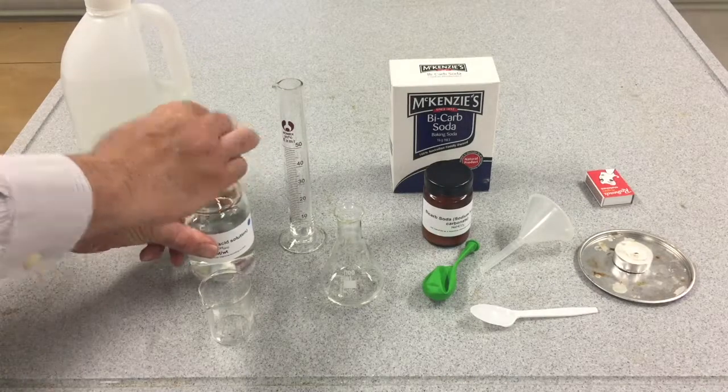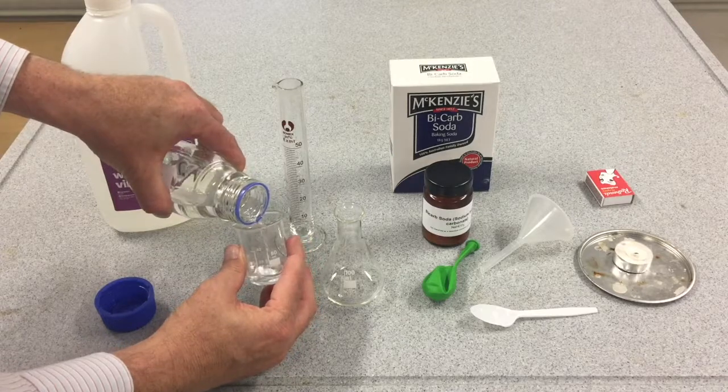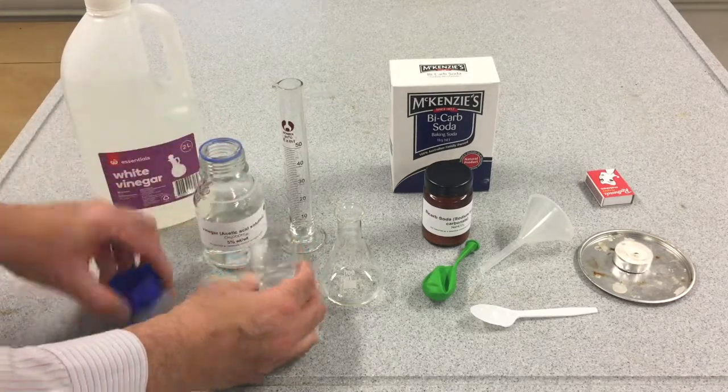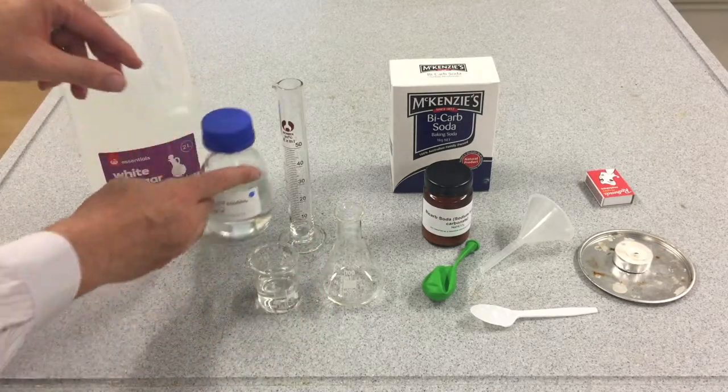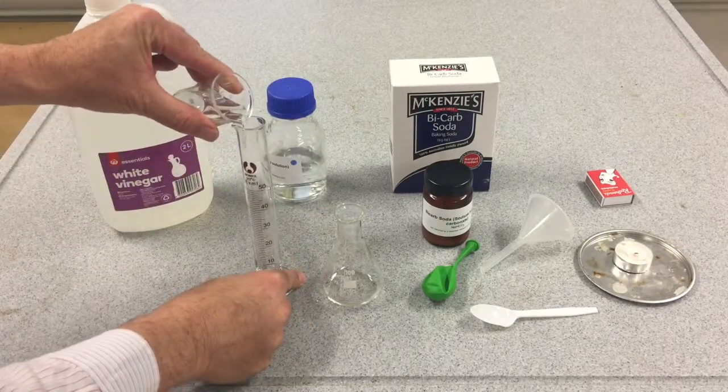For the experiment air has space and mass, there are two parts. In the first part, pour some vinegar into a beaker, probably about 30 mils, and then use the beaker and the measuring cylinder to measure out exactly 20 mils of vinegar.